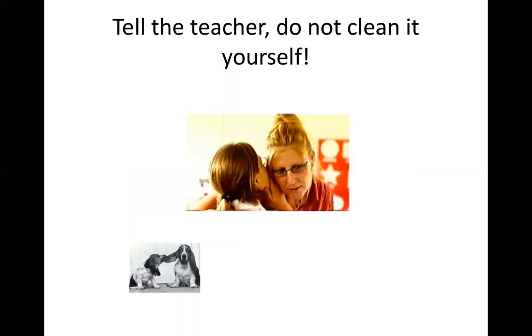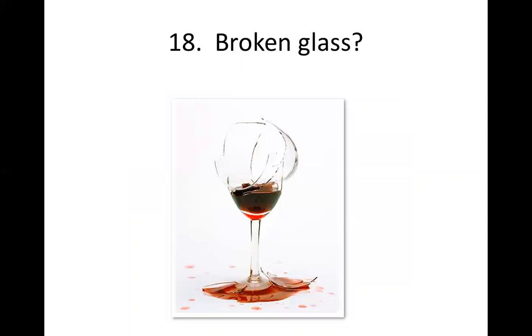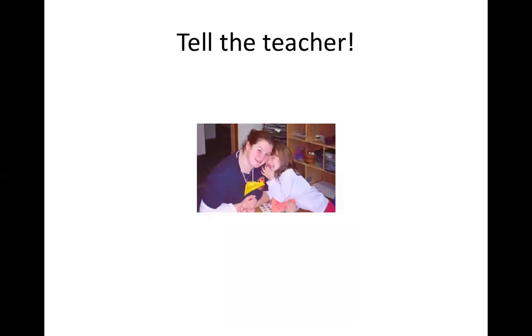And like I said, it's very important. Always tell the teacher. Do not clean it by yourself. You do it with the teacher, or the teacher will do it for you. In case of broken glass, the same thing. Tell the teacher. Do not clean it by yourself. You will clean it with the teacher, or the teacher will clean it for you. Always, always tell the teacher, regardless if it's a small spillage or just a small broken glass. Okay? So that is the end of our first lesson.